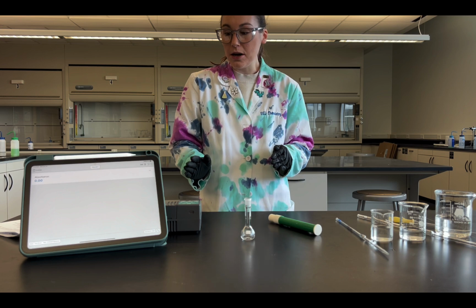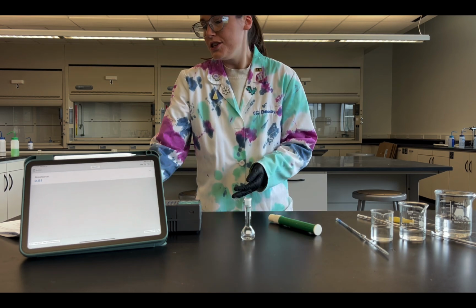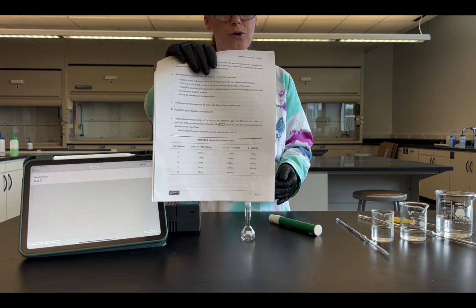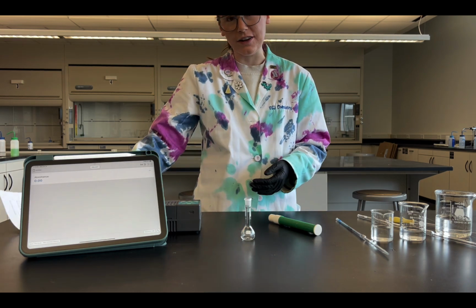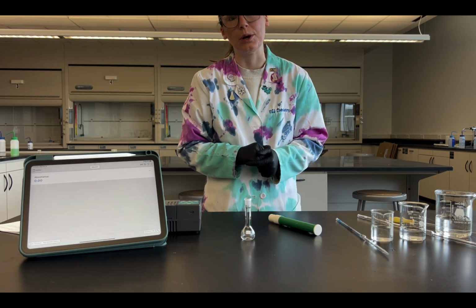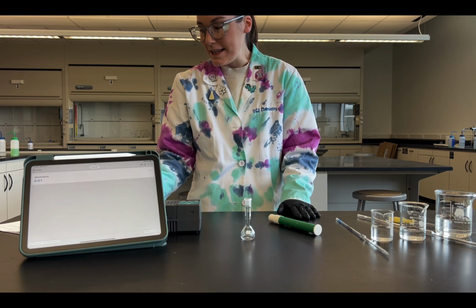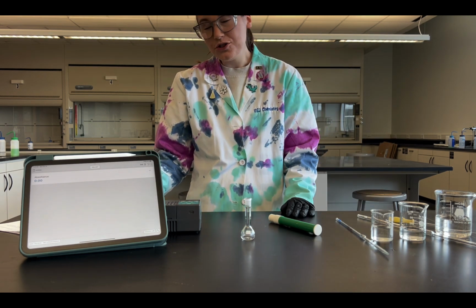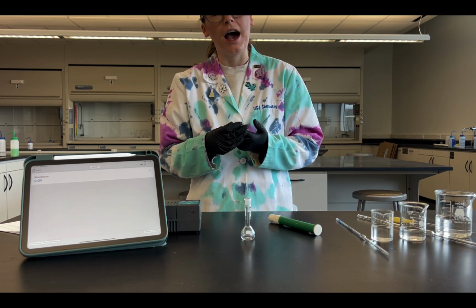So in this part of the lab, we are doing another dilution experimentally. The dilution is in a different table, so we're going to use slightly different numbers for our calculations of our M2s, but we are going to do those in a very similar way, which we'll see in the data workup portion of the lab. So I'm following a slightly different table. I have adjusted my solutions here because the concentrations of the iron nitrate and the sodium thiocyanate have changed.